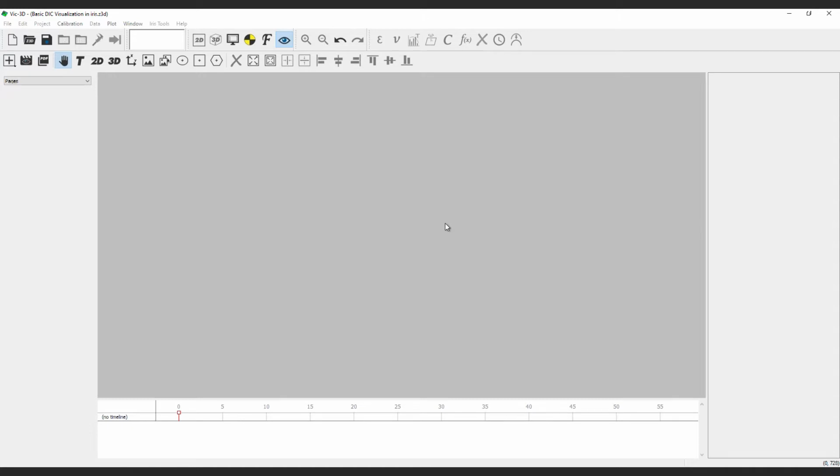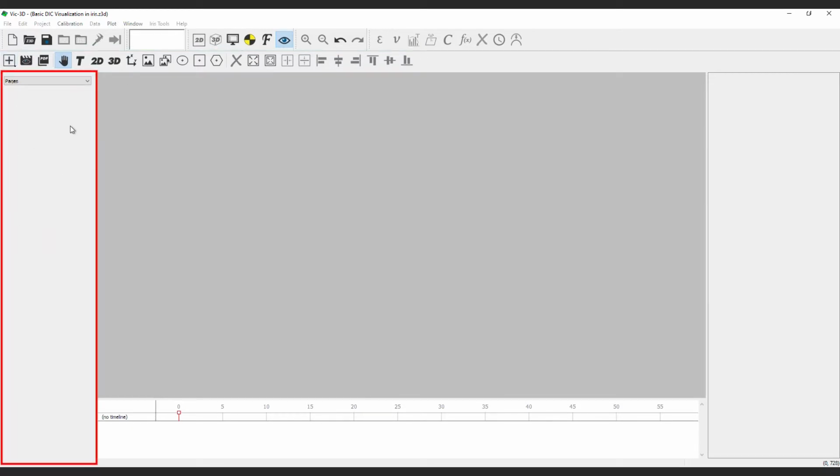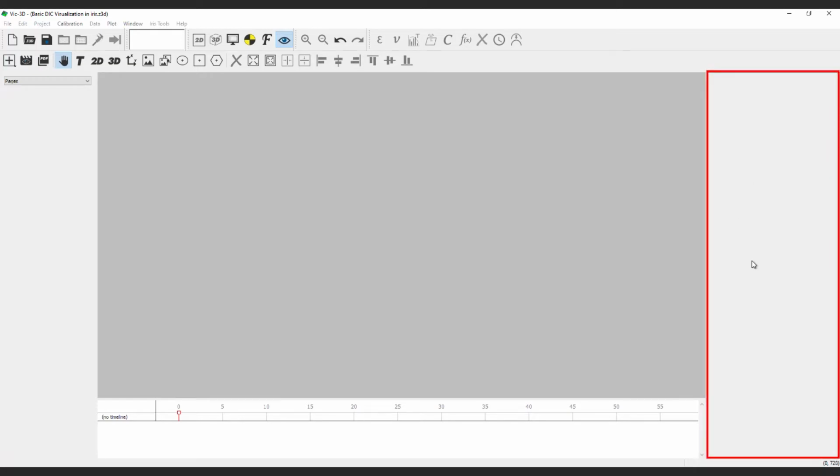The Iris workspace contains the following: the main toolbar, which has controls for inserting new objects like plots and images, alignment controls, and buttons for exporting PDFs and video. The Page Navigator. This is in the left sidebar and shows a graphical list of pages, templates, and backgrounds selectable from the pull-down. The Properties Editor. This is in the right sidebar and has a list of adjustable properties for the currently selected item.